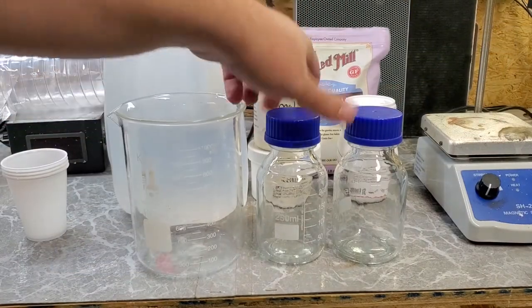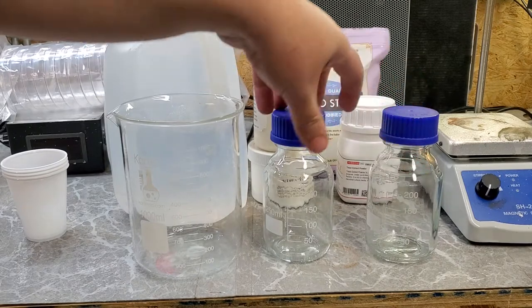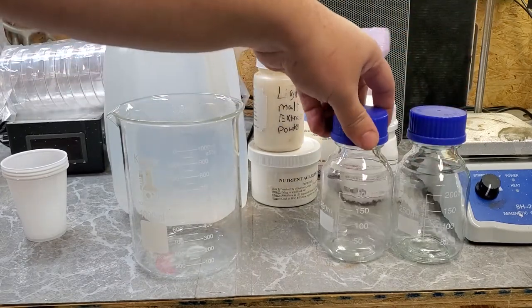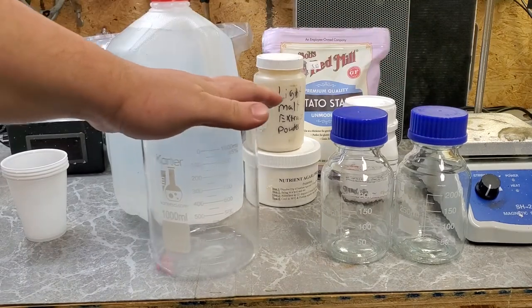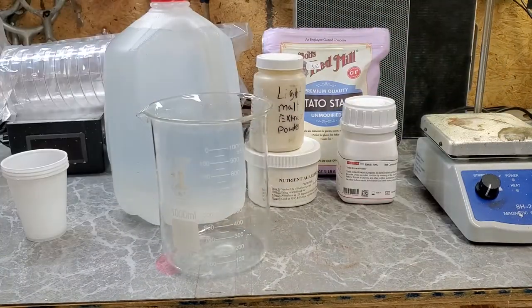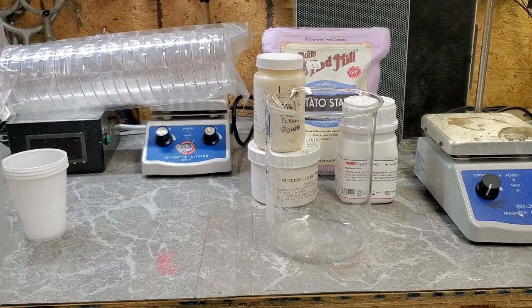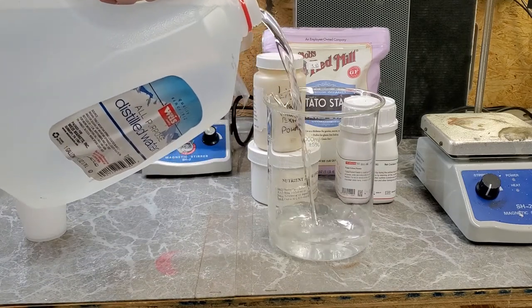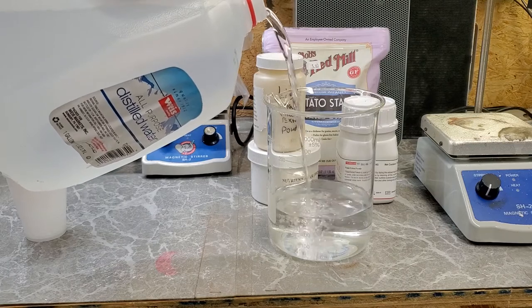Since I am using these two bottles to put into the instant pot — which is just a self-contained pressure cooker — I need to mix up 400 milliliters of the agar solution. Let me put these off to the side and measure out 400 milliliters of distilled water. You could use tap water, but I do like to use distilled water if possible.